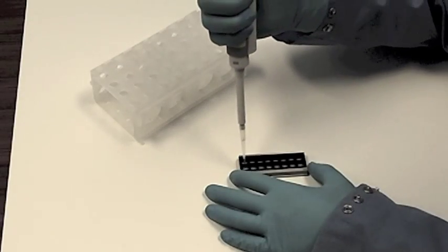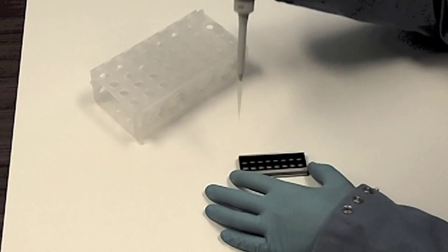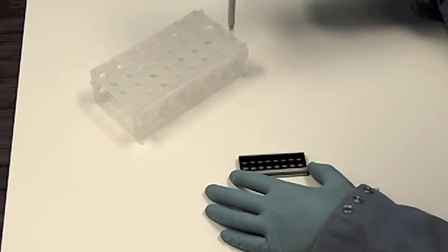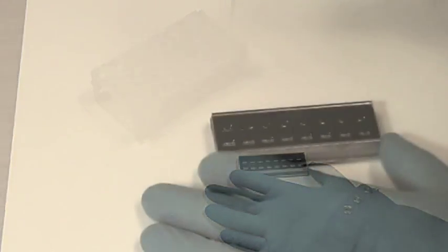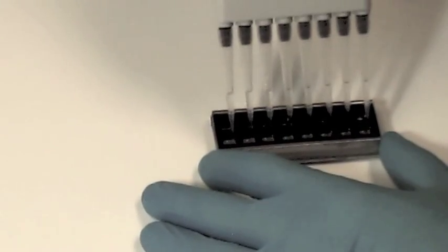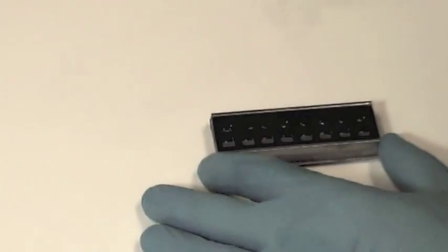The individual chambers can be treated with the same or different samples for hybridization. For multiple chambered modules, the spacing of chambers is completely compatible with multi-channel pipetters, enabling efficient handling and consistent results.